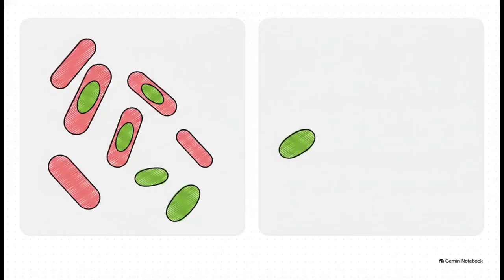And for the ultimate microscopic survivalists, genera like Bacillus and Clostridium, we have the Schaeffer-Fulton spore stain. These bugs produce highly resistant structures called endospores to survive extreme conditions. To unmask them, we use a primary stain of malachite green, which locks tightly into those tough endospores. We then counterstain the rest with safranin. The end result? The highly resistant endospores appear a vivid, striking green, while the normal, vulnerable vegetative cells take on a soft red or pink color.